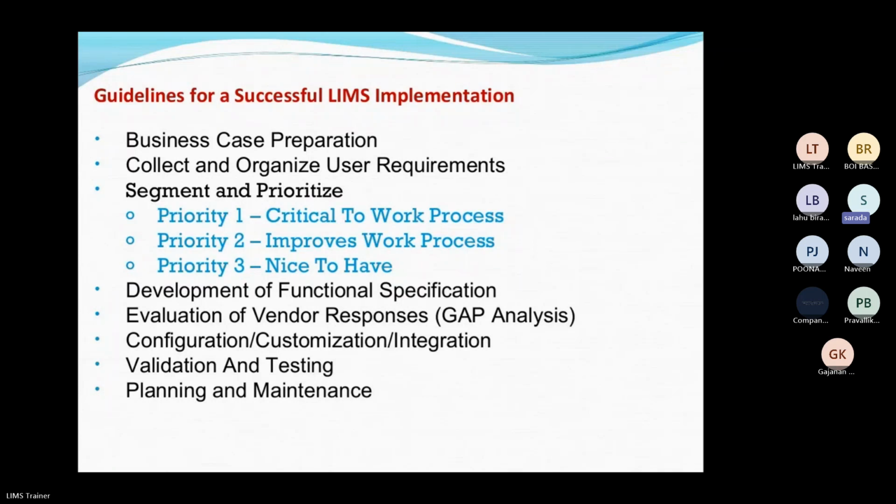With whatever you explain in these classes, in the course of the days we are interacting, will we be able to attend interviews on the software side? Interviews about what? Which role? The LIMS role. Yes, definitely. That is the purpose of the course. I will explain the syllabus of the course after this slide, and there you will find everything that is involved in it. Suppose you are in an implementation role, or an end user role, or in stability management or inventory management, whatever different modules are there inside the LIMS software, I am going to explain all of it in further classes. That will help you in your interviews, any kind of interview related to LIMS.